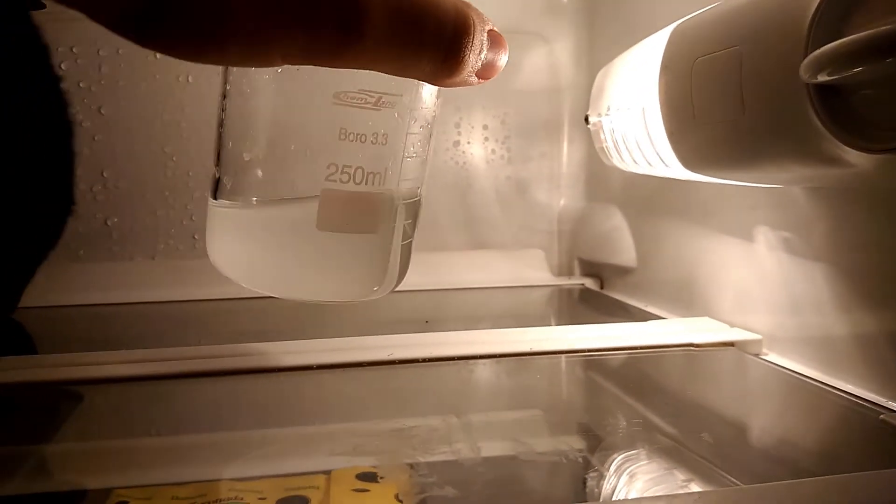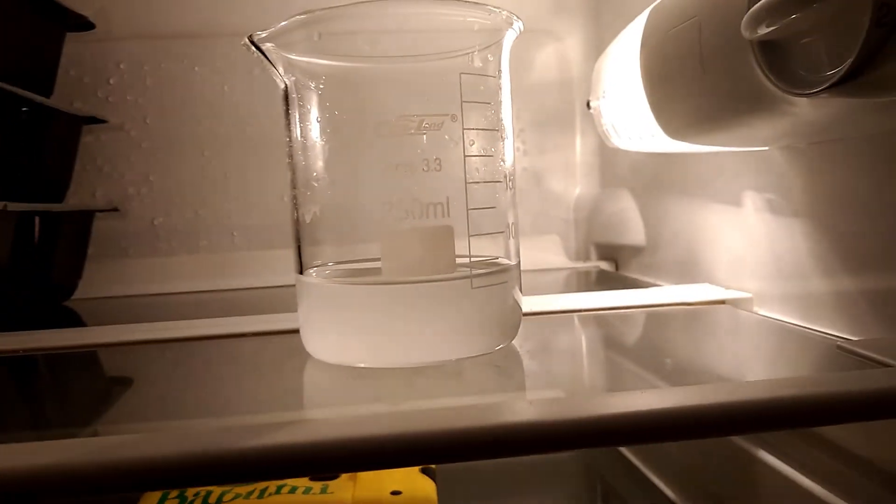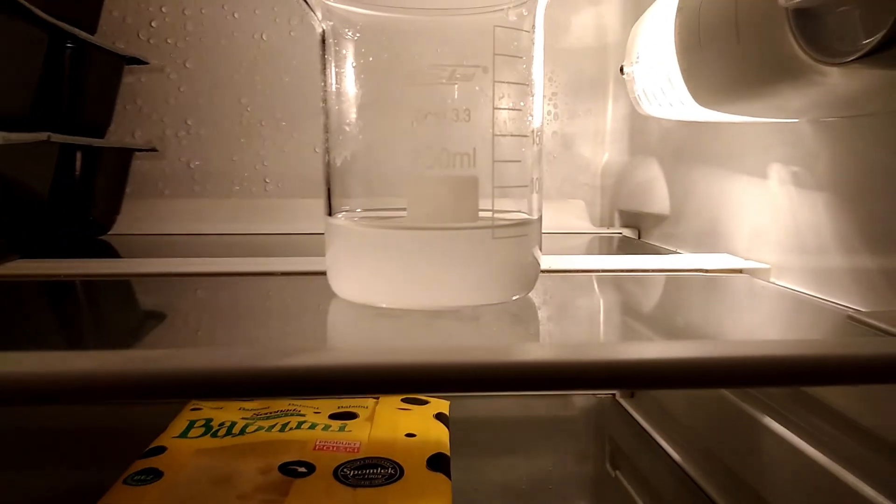So now I'm gonna recrystallize this, just to purify the final product. This will take a few hours, so see you tomorrow.